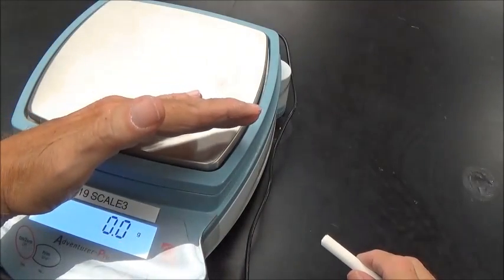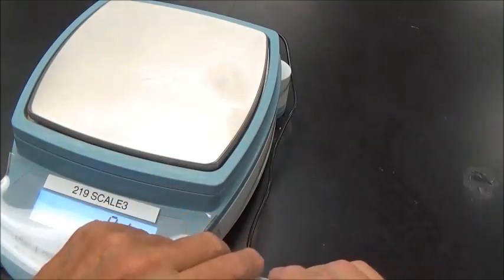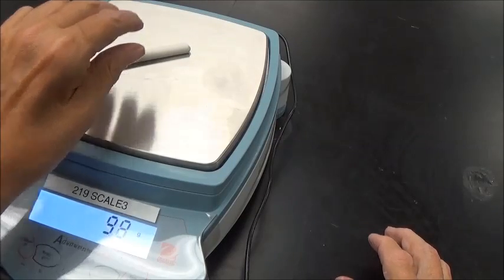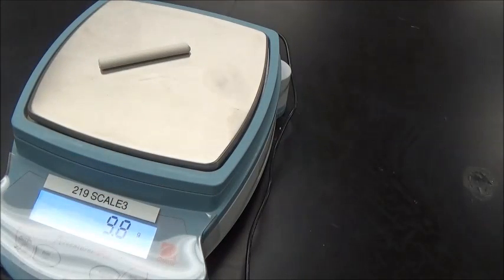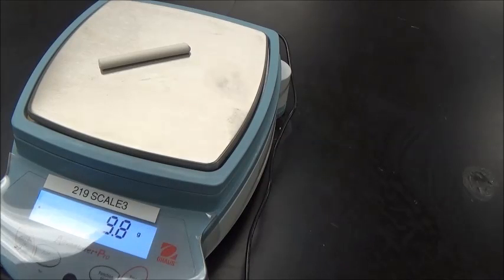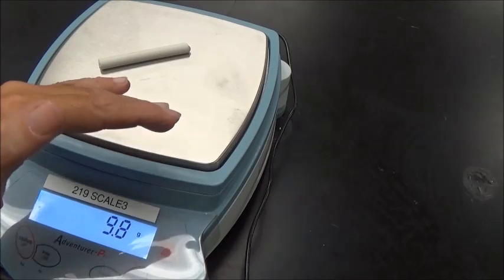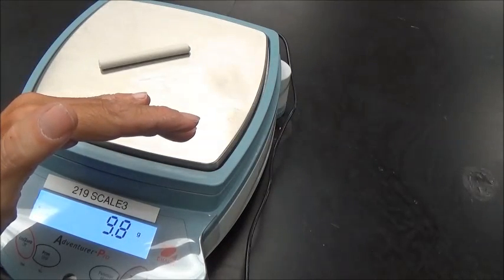Now I have here a nice balance. I'll block the fluorescent light. You see it's on 0. I'm going to put this on and let it stop, and I'm going to write down the amount of grams it is. It's 9.8 grams. Let me write that down so that I don't forget it. You could see that very clearly.